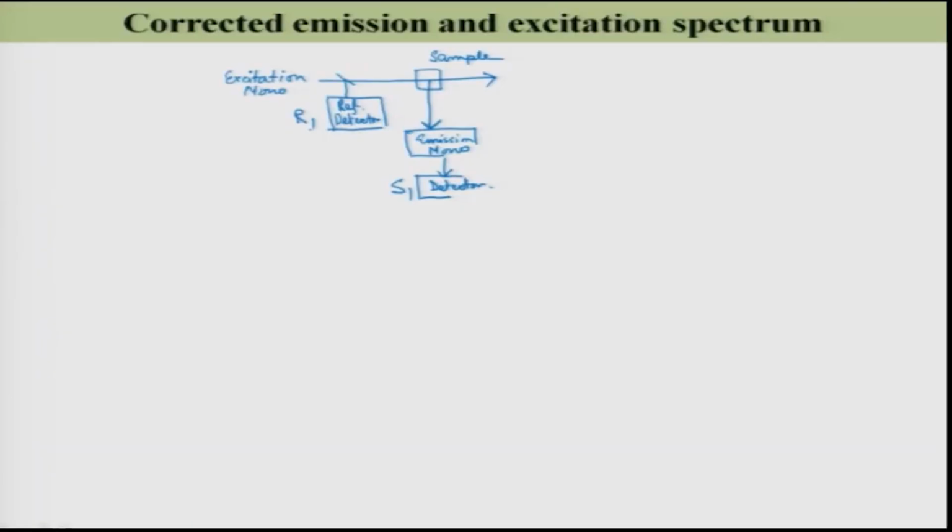So, for this excitation spectrum, what you need to do is fix the emission wavelength at your choice, and then scan the excitation wavelength.